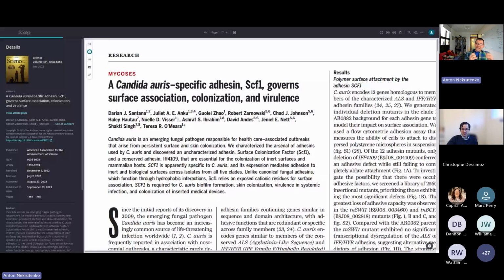RNA-seq is interesting because it's one of the less straightforward analyses. I'm talking about RNA-seq designed for differential gene expression, and you can kind of separate this into 2 steps. First, you just generate the counts.